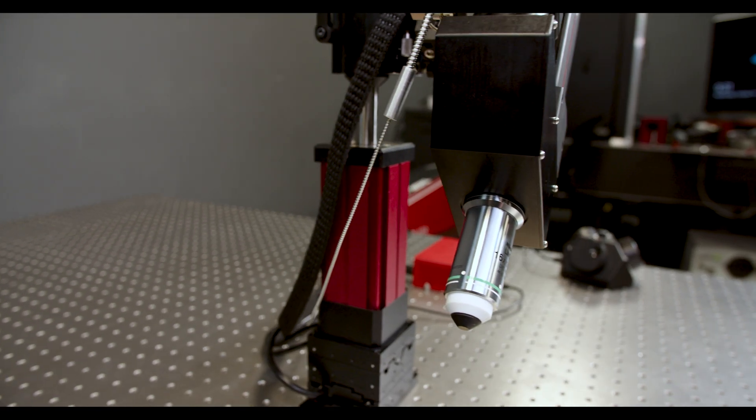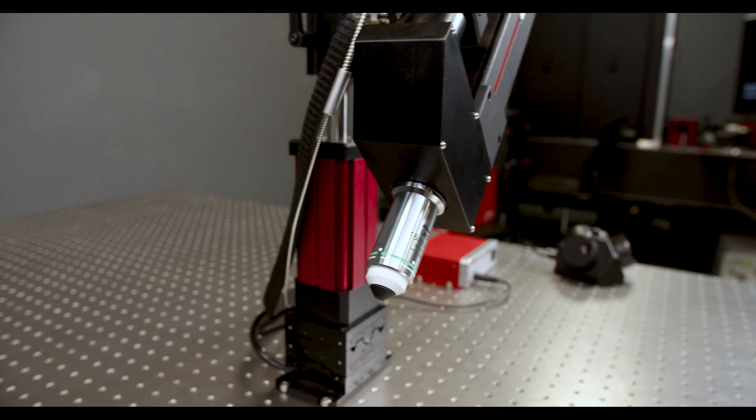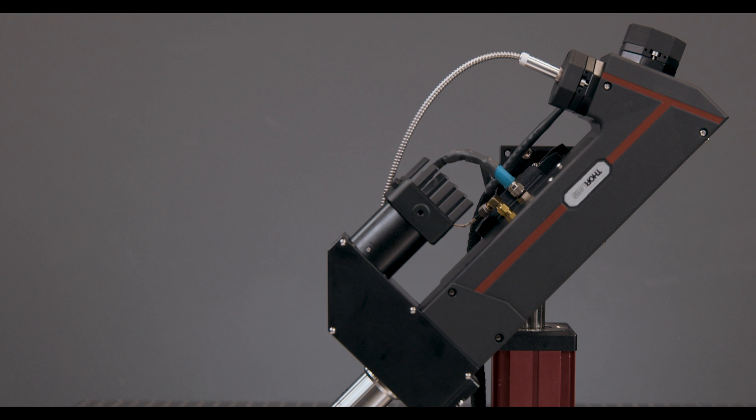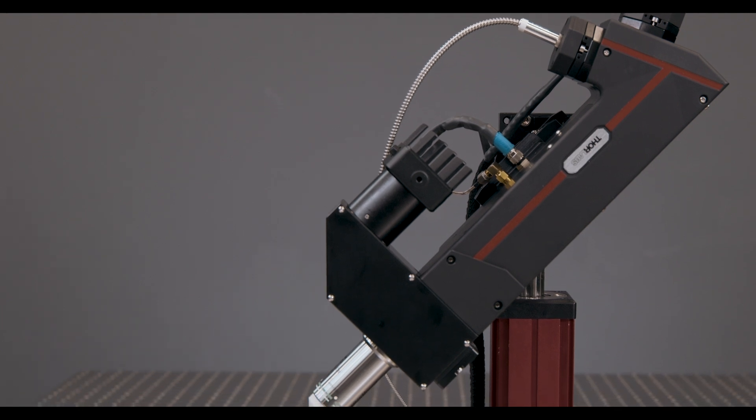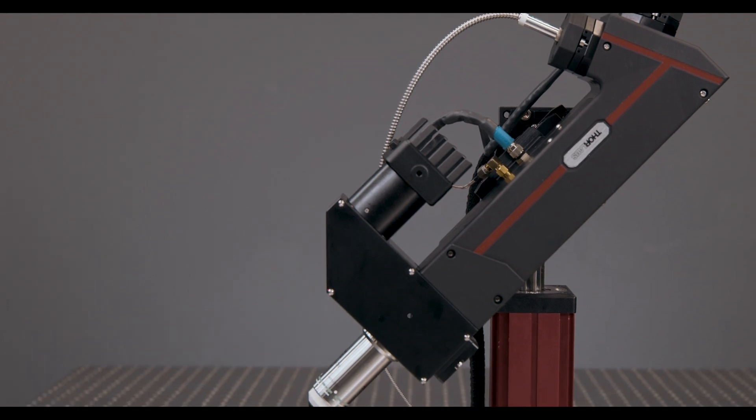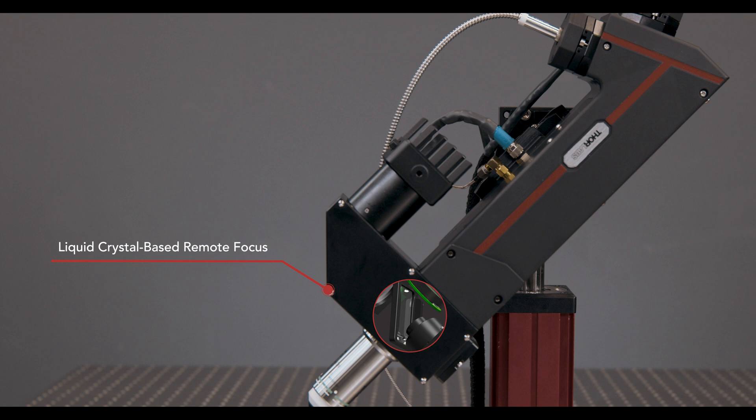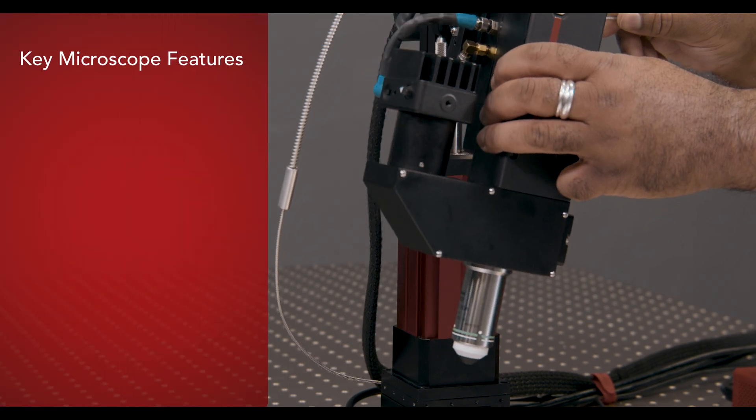There are many exciting things in this system. The remote focus is one of them. It's driven by a very novel liquid-crystal phase-plate system that was developed specifically for this application.